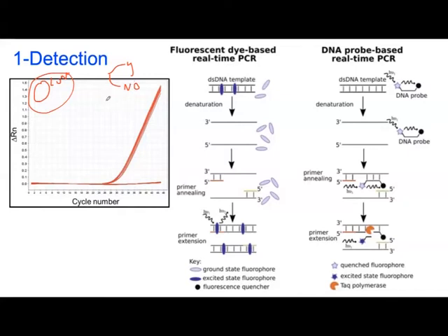The other thing you need to know is strains, as I told you: is this strain present or not present? If there is a bacteria, is this bacteria resistant to a certain drug, yes or no? So that's basically what you need to do in this application: you want to say yes or no in the reaction. What you do in this protocol, you can use the SYBR Green fluorescent dye.